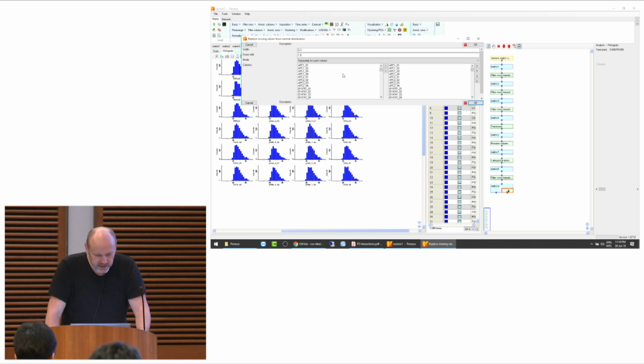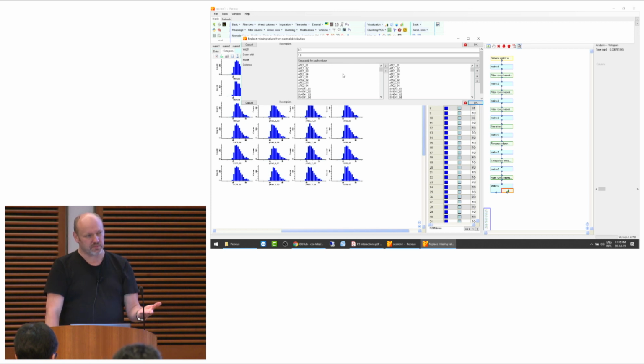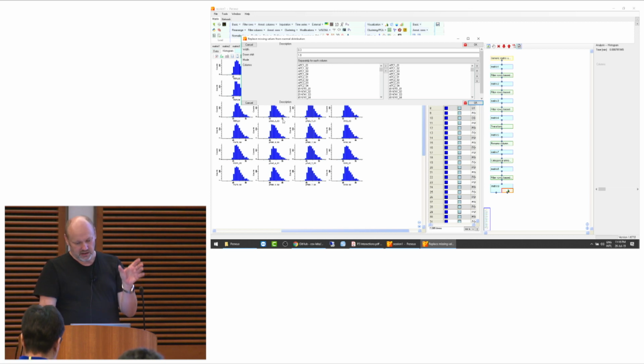And we replace missing values from a normal distribution. And I think you went over that already, right, in proteome, that this is basically saying, okay, we want to replace missing values from a normal distribution that is chosen in a way that it's basically simulating the noise, the signal noise boundary, so that the values that are added end up on the left flank of these histograms, right?